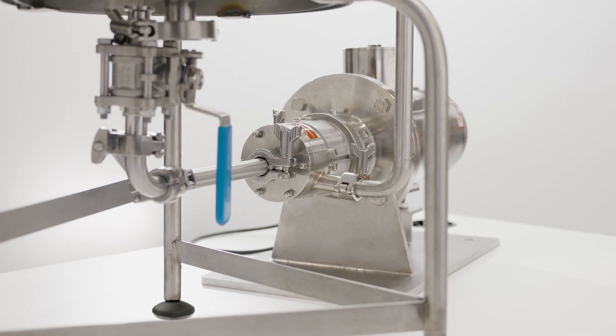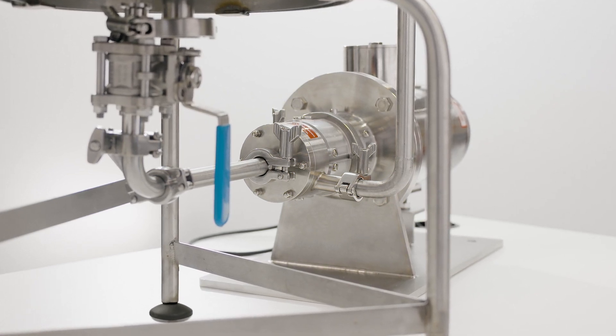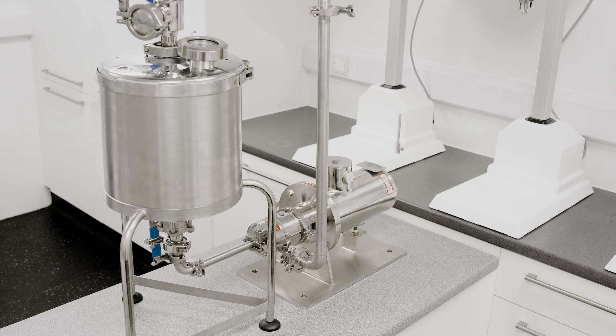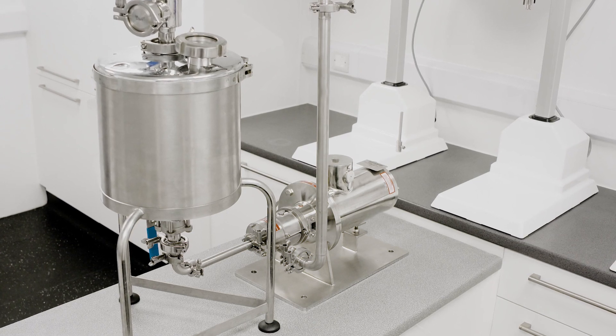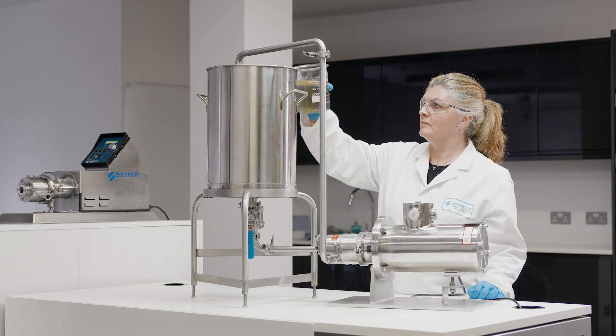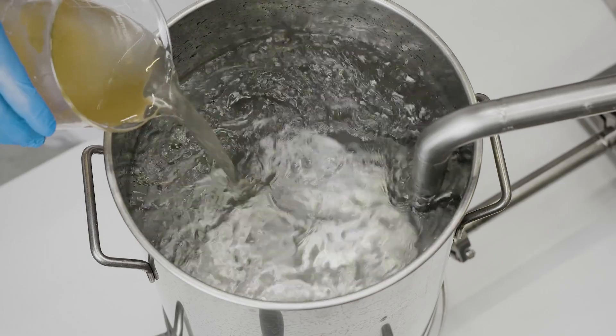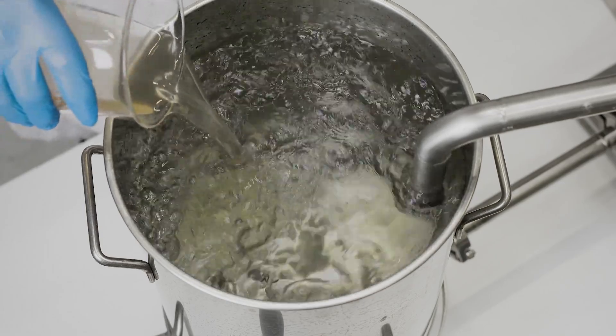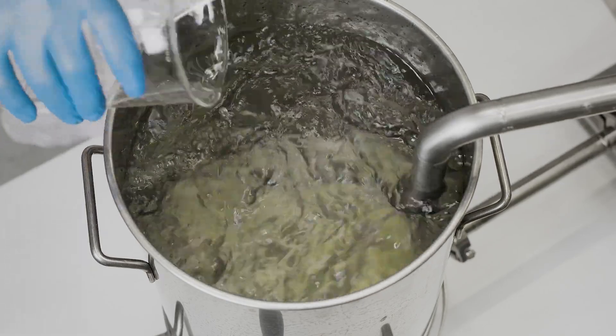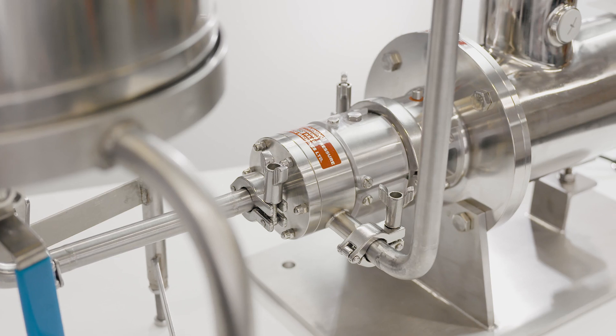The new 150UHS inline mixer is designed for ultra-sanitary applications typically encountered in the pharmaceutical, biotech, and other clean industries such as food and cosmetics, where the smallest production-scale mixers may be too large but laboratory equipment doesn't offer sufficient capacity.